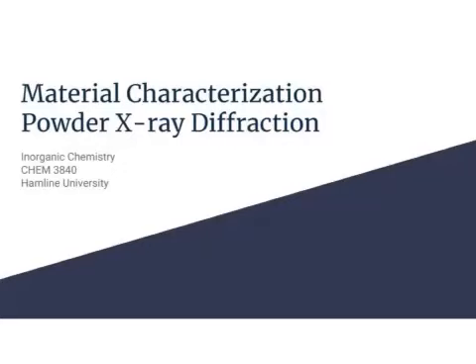Hey everybody, this is the second installment of our video project for the Inorganic Chem class. It is a material characterization presentation on powder X-ray diffraction. We got a lot to get through, so let's jump on into it.